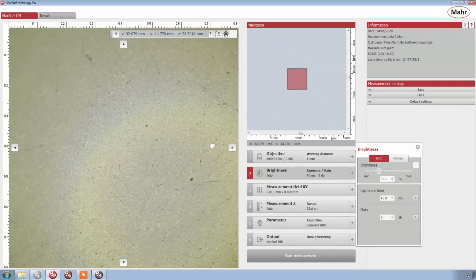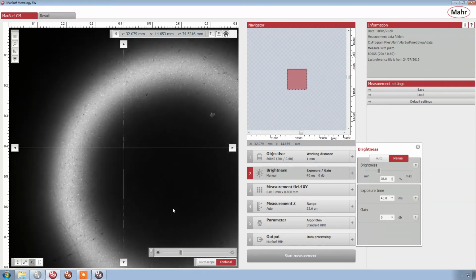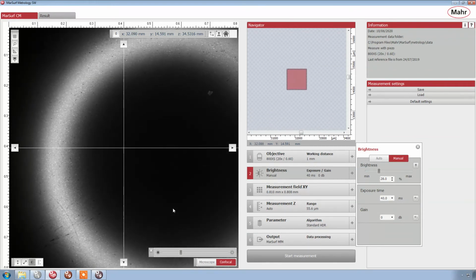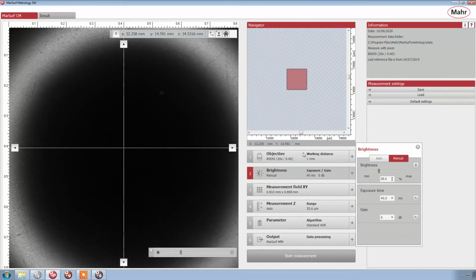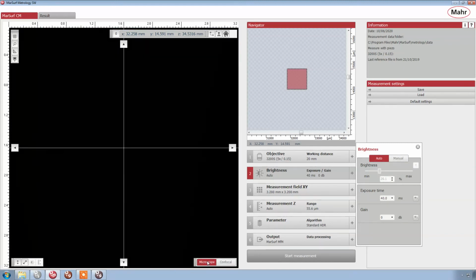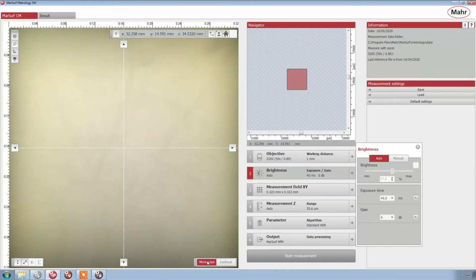Now to find the apex, when you're measuring a sphere like this, you're usually going to have this kind of ring-shaped focal pattern, and I use that focal pattern to get myself centered on the apex of the sphere. So we're still in the 20x lens. For this particular measurement, I'm going to move over to the 50x lens. Again, I've got to refocus a little bit.